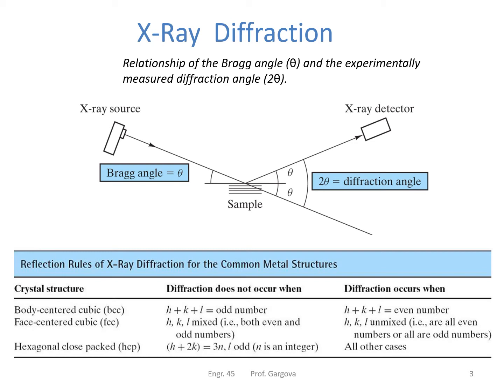And then the Bragg's angle is the angle relative to your sample and the X-ray source, so the incoming X-ray source. Now, this 2 theta, we saw that it's basically the angle from the incoming X-ray to the X-ray detector, which would be 2 theta. And basically the theta would be the Bragg's angle.